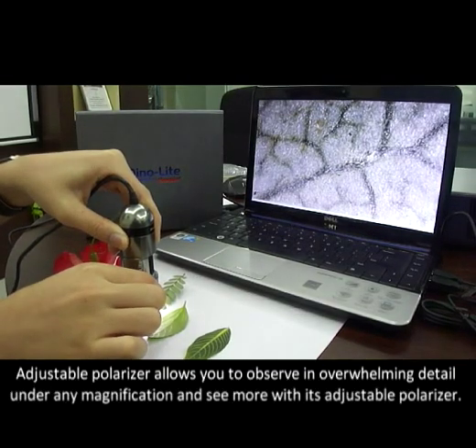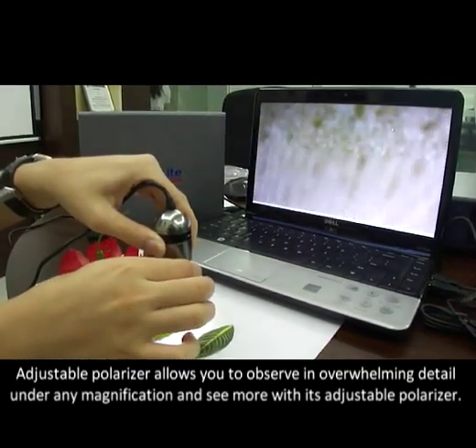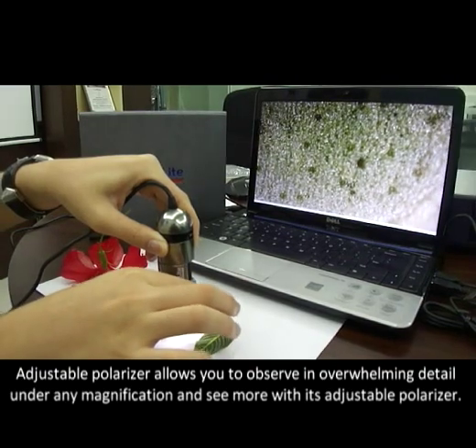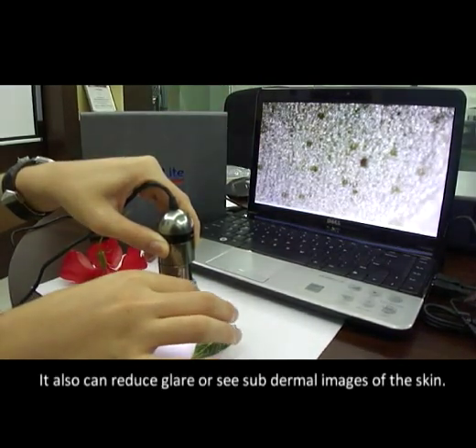The adjustable polarizer allows you to observe in overwhelming detail under any magnification, and see more with its adjustable polarizer. It can also reduce glare or capture subdermal images of the skin.